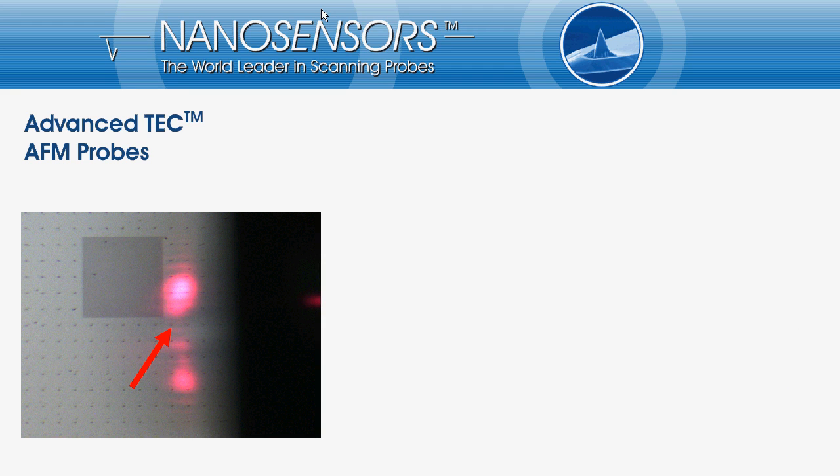What does tip visibility mean practically? We want to image a given point of interest. Here it is the dot where the red arrow is pointing on.